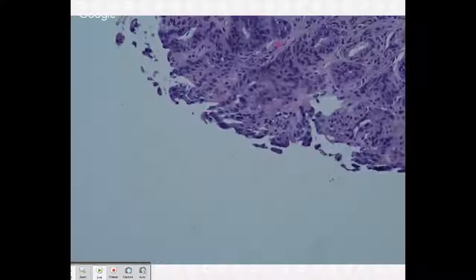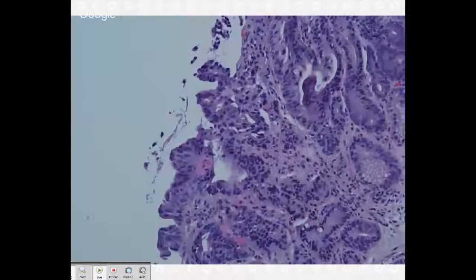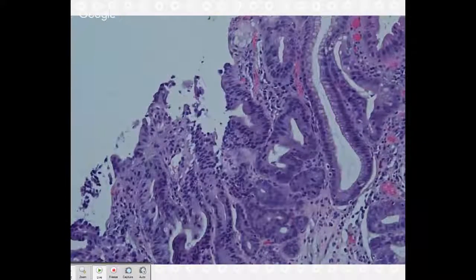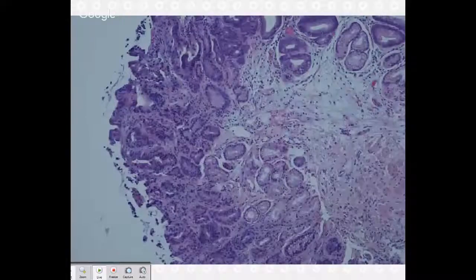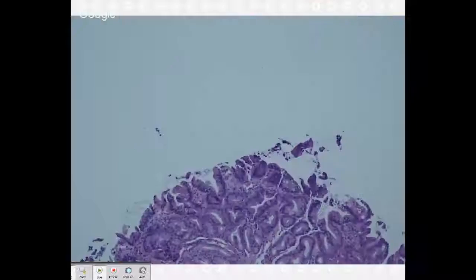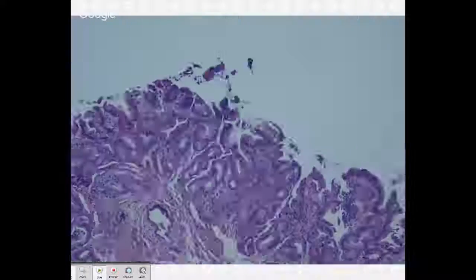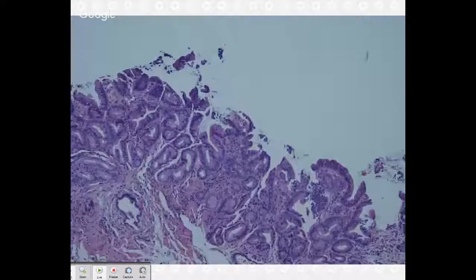So this is a high-grade Barrett's esophagus. These are the ones you want to catch because these are the ones that we know we actually have data to show that if we can catch these patients with high-grade Barrett's before it progresses to an invasive adenocarcinoma, we can actually have prolonged disease-specific survival. So these are the patients that it's super important to make sure we diagnose correctly.